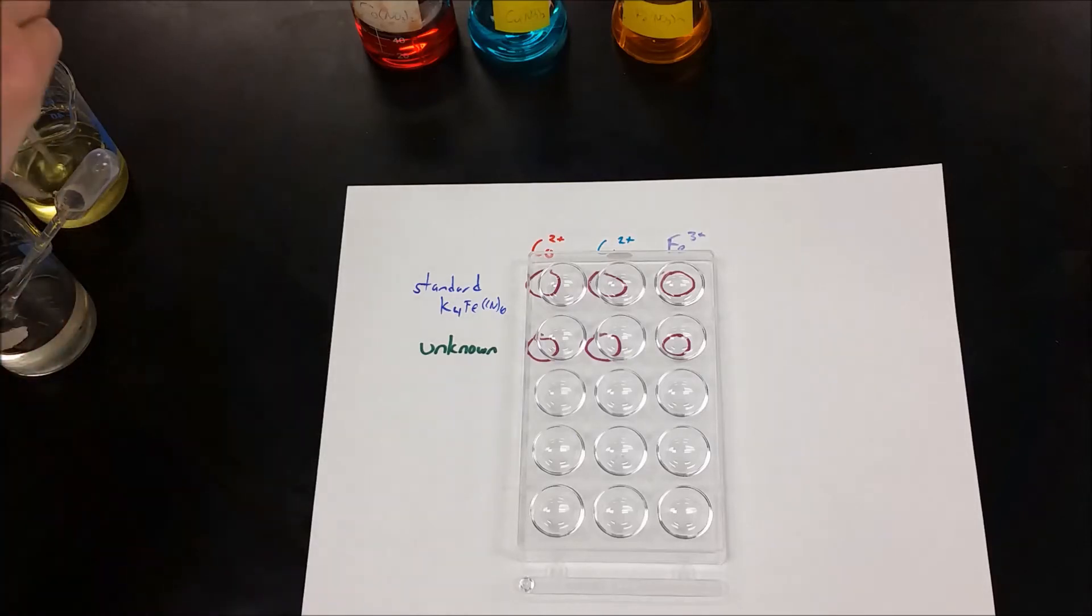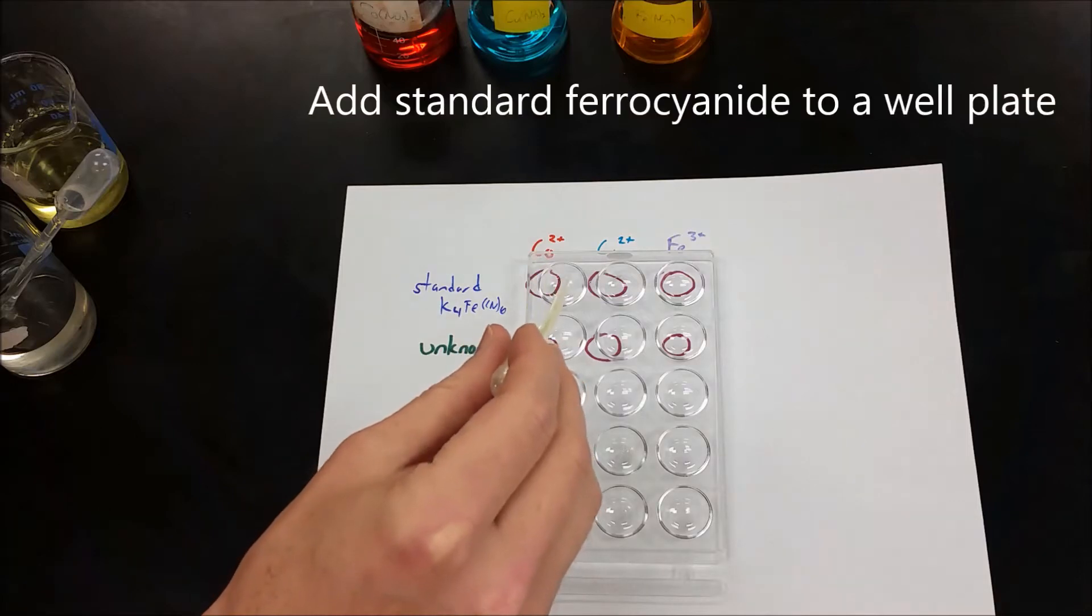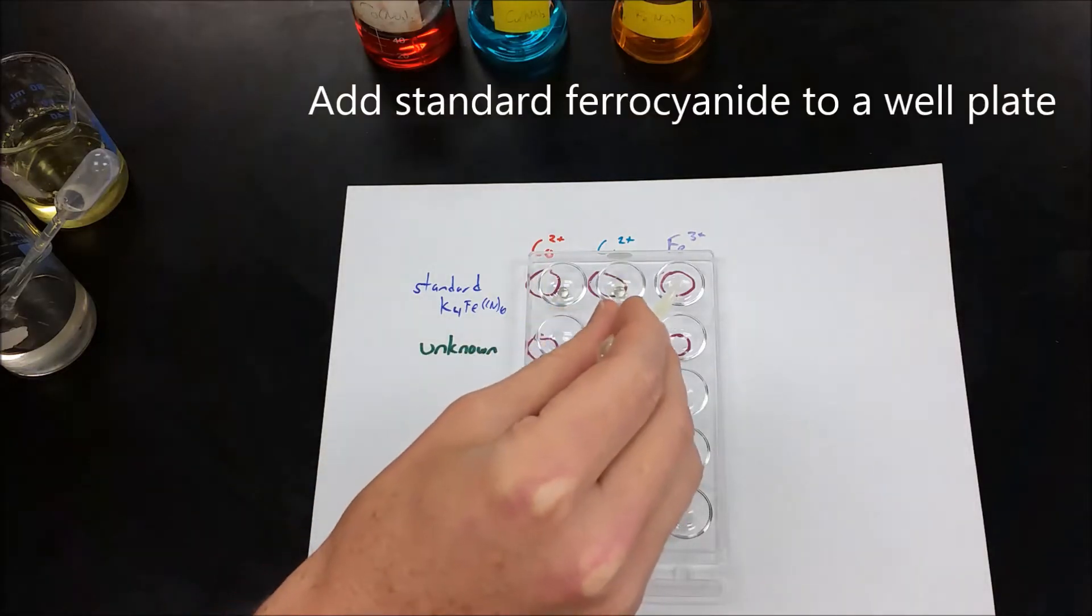For the ferrocyanide test, we would pick out any ferrocyanide, and there's only one, potassium ferrocyanide, and we would put a drop into a well plate.